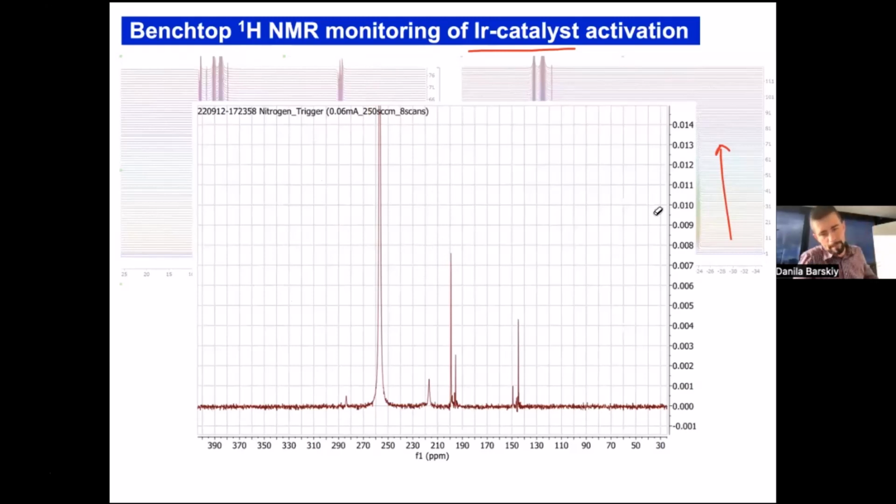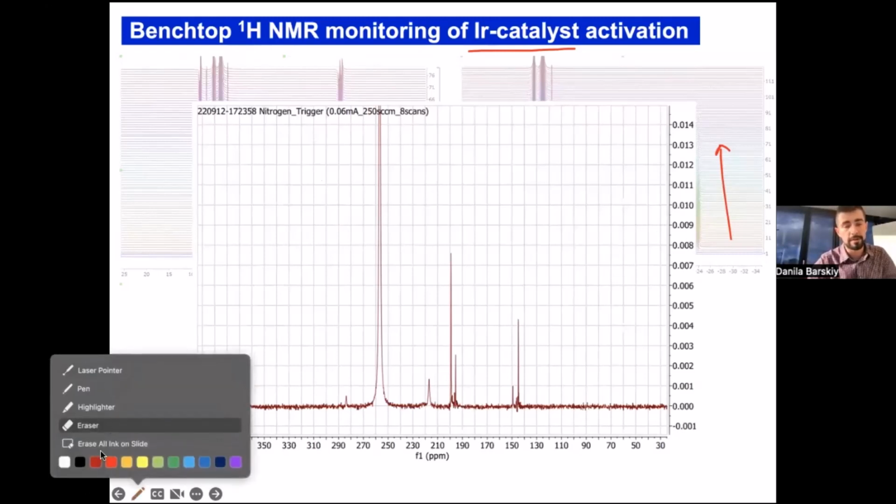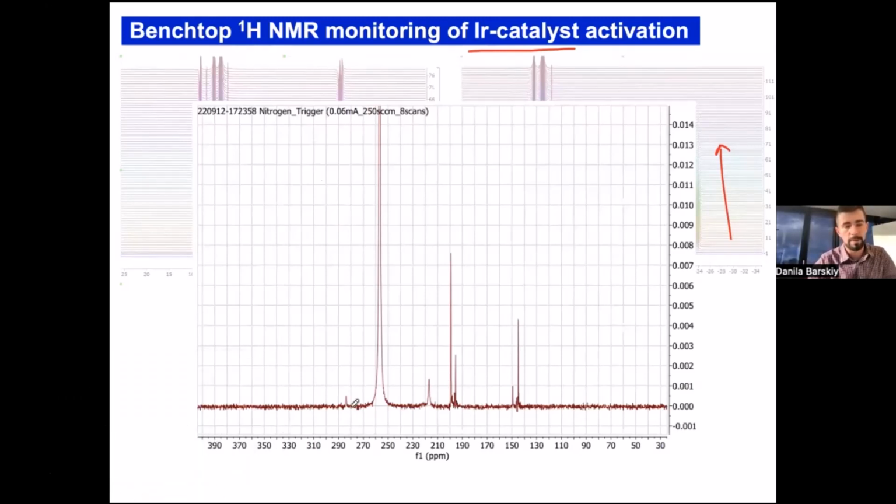from chemicals from the family of pyridine groups. And we see different complexes, different structures associated with complexes in the nitrogen-15 spectrum at 1 Tesla. So once again, some of these peaks we can identify. So this is a free substrate, and we see some bound substrate species to different types of complexes.